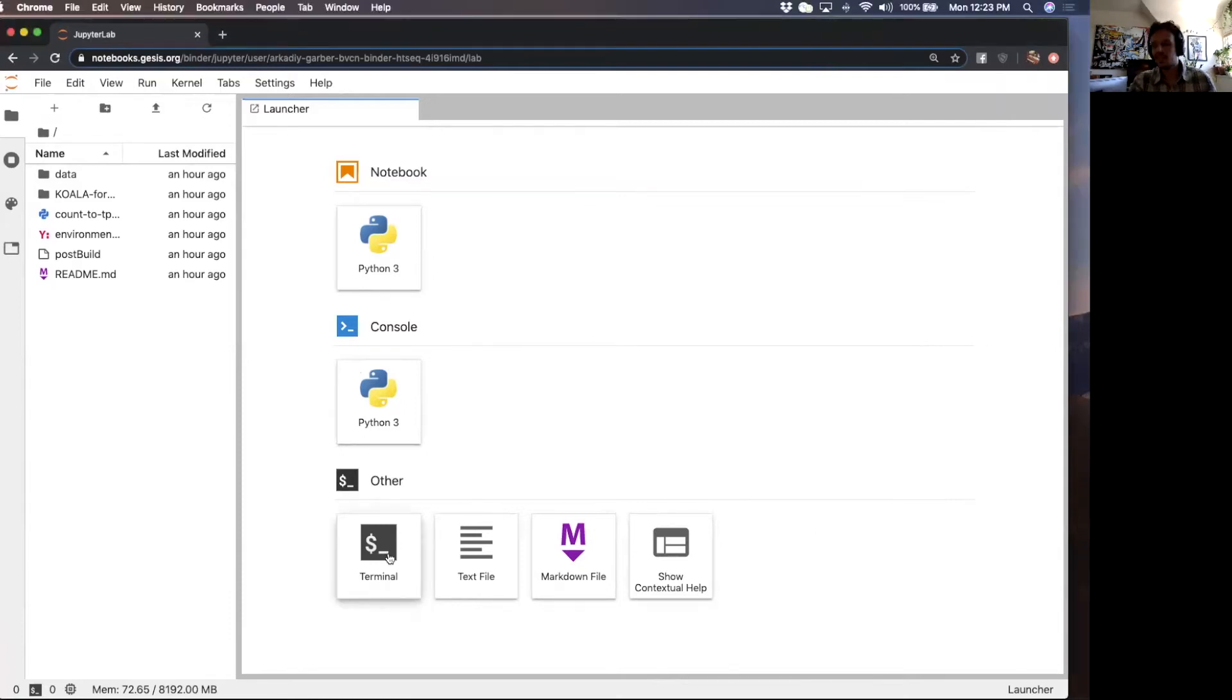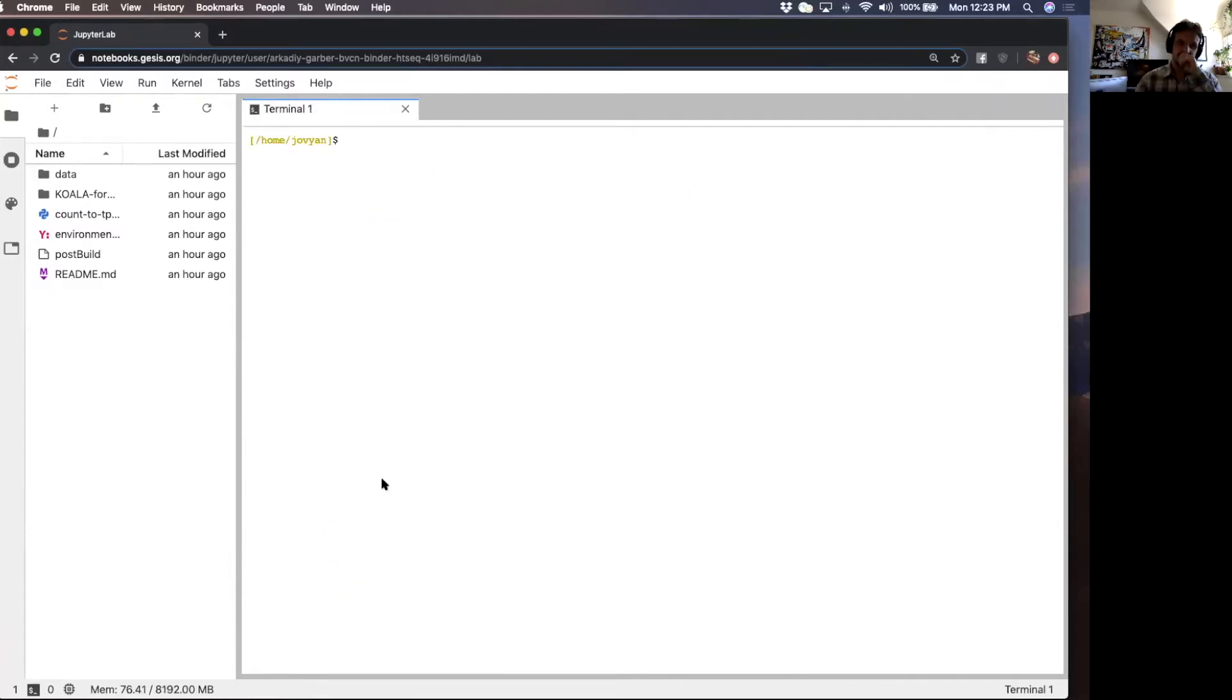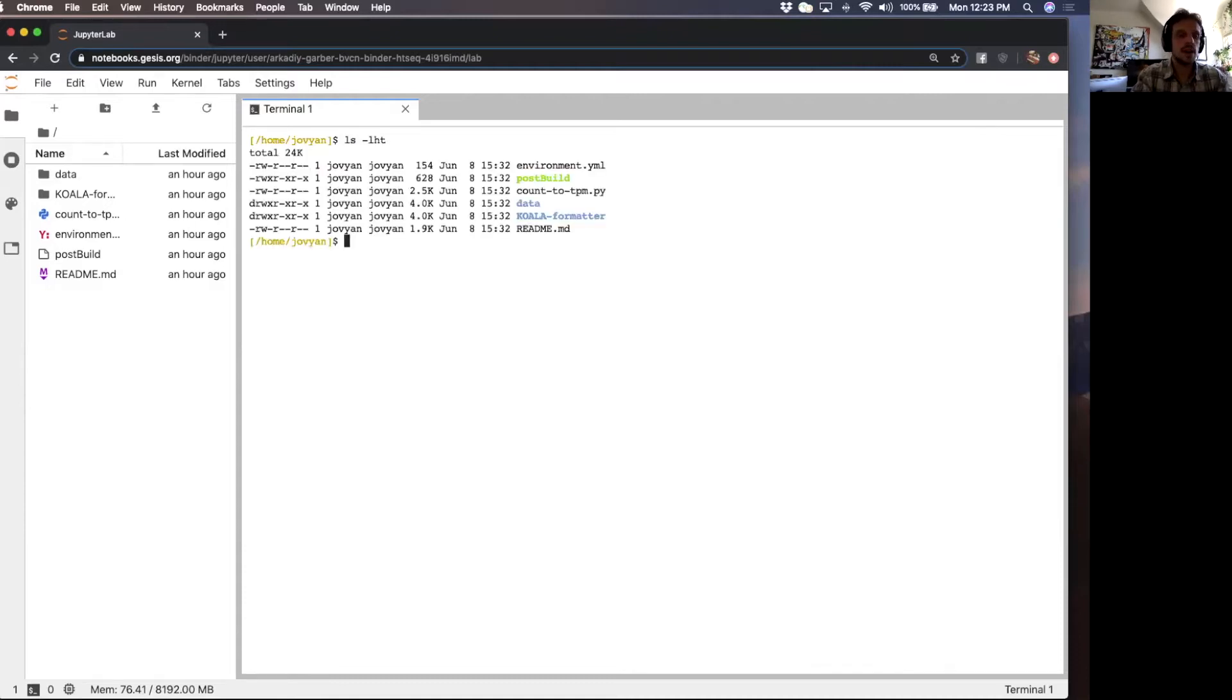Welcome to the HTCount tutorial. I'm going to start my terminal session here in JupyterLab and let's take a look around and see what we have here.